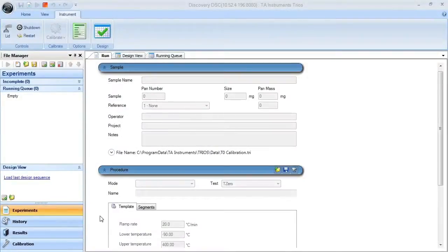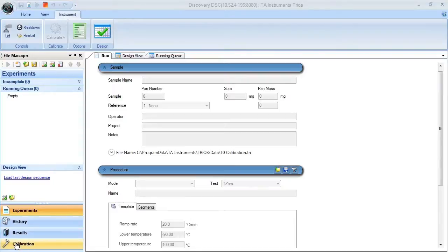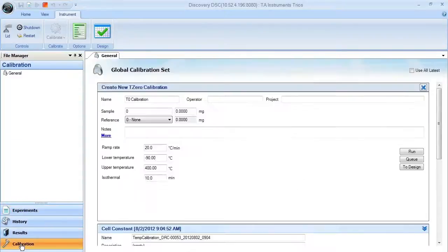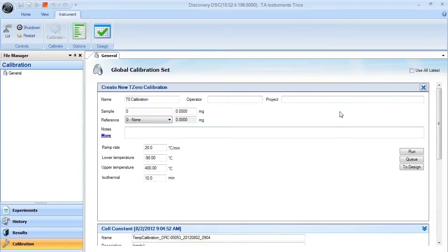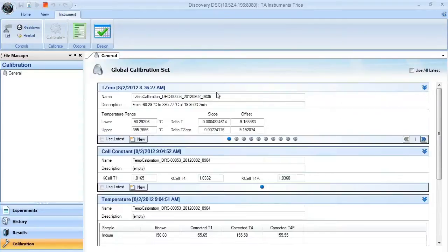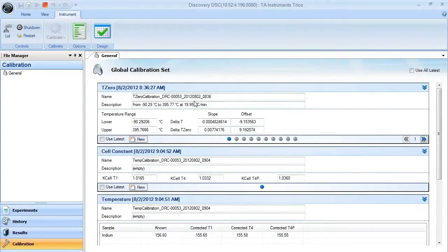To set up and analyze the T0 calibration for your Discovery DSC, make sure that you select the calibration menu item here, and it should bring you to a window that includes all of the calibration data for that particular DSC.